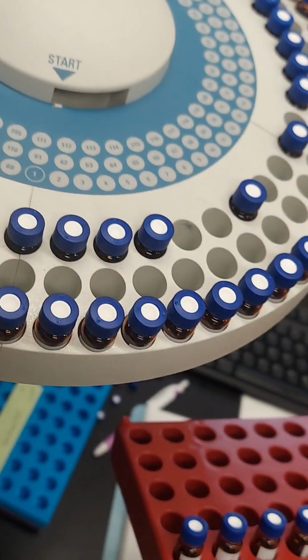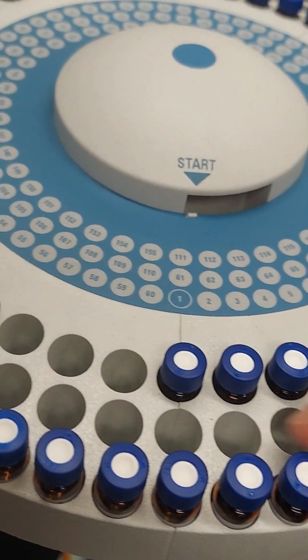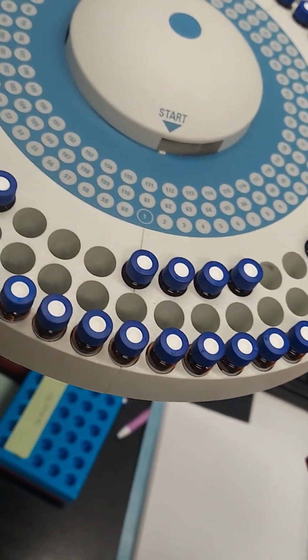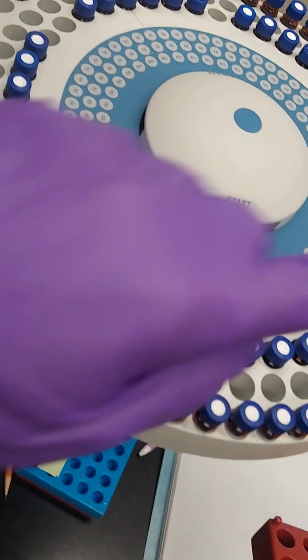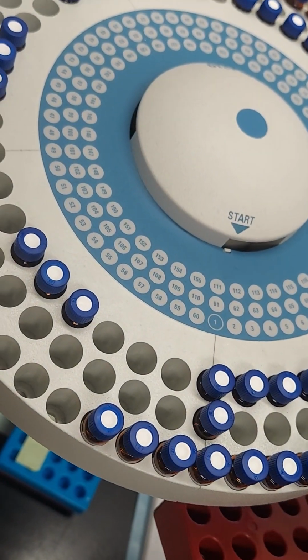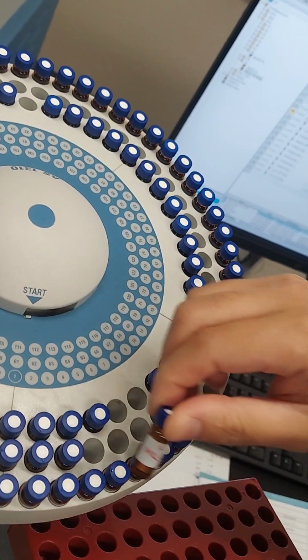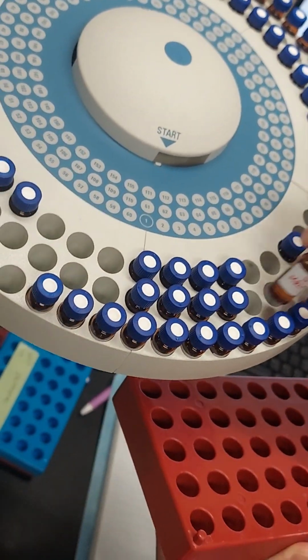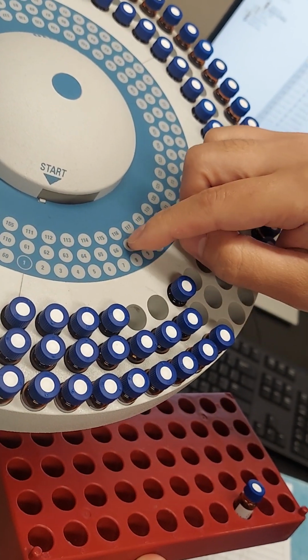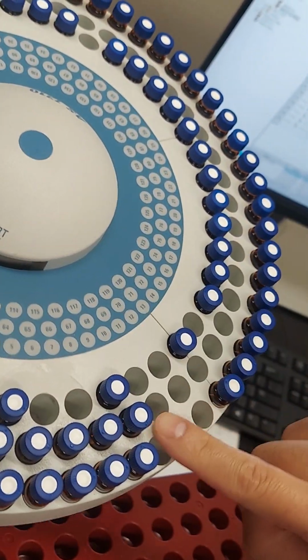Yeah. We have these 8 samples. We'll put them in 61 through 68. Okay. Right here. So you need to change there, right? After you put it here. So 61, 67, 68. Yeah, it's a little hard to line up, but yeah.